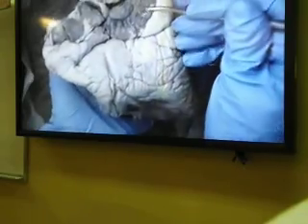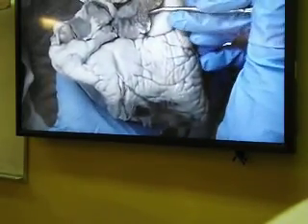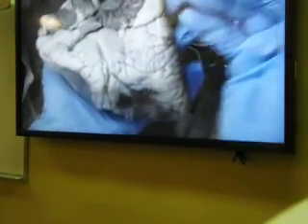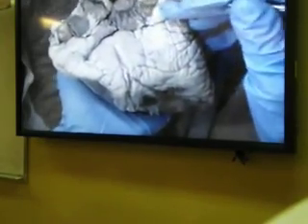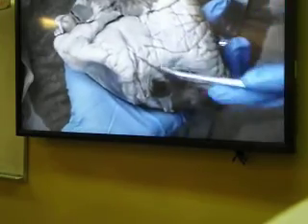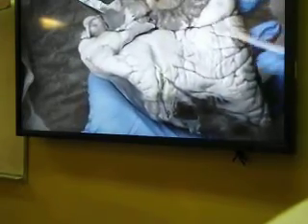Over here on this side is the left atrium, the chamber. If I ask you to name the structure which is covering the chamber, that will be the left auricle. You know it's an auricle because it has a dog ear-like structure, but the chamber we only call atrium or ventricle, and obviously this is the upper chamber, so this has to be an atrium. It's on the left side, so left atrium. And then this huge chamber here, all the way, this is the ventricle, the left ventricle. So it's a pretty big chamber for the left ventricle. Right?